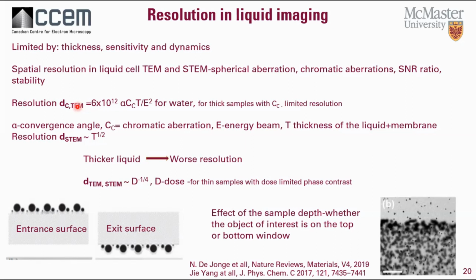It's also important to know on which side of the window the particles are sitting. In the case of TEM, the highest resolution for an object in a thick liquid layer is achieved when the object is on the electron beam exit surface. For STEM, this is the opposite. Because of the probe broadening, the highest resolution in STEM is achieved when the objects are on the top of the window.